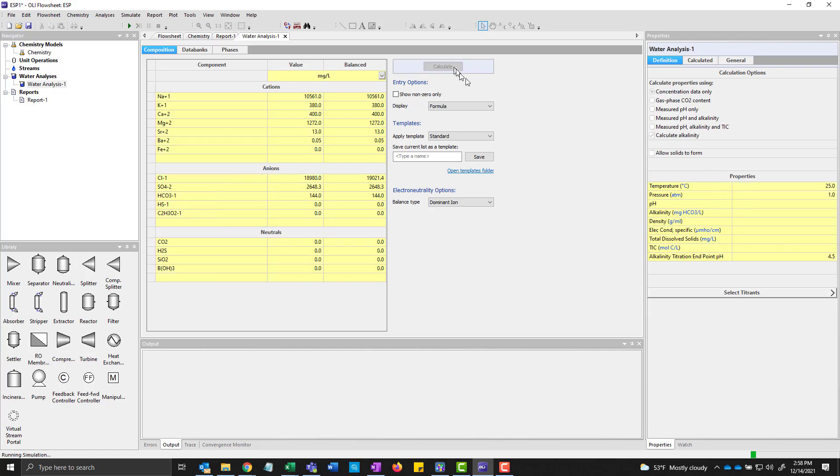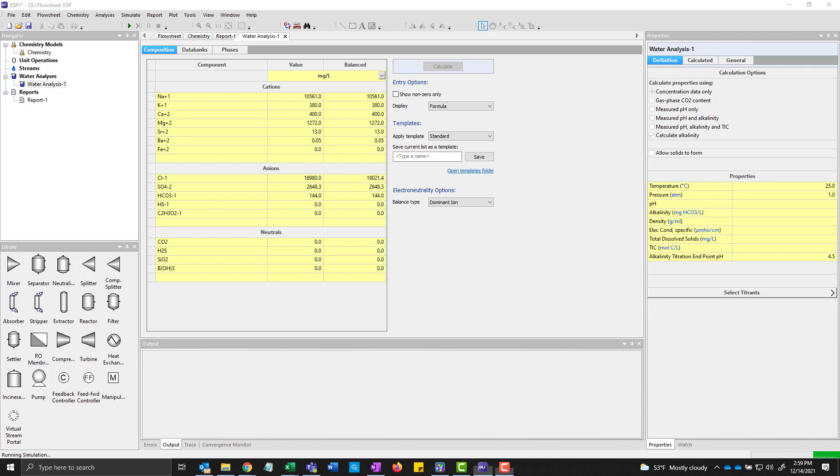We'll go ahead and calculate it. And it'll take a moment or two to actually calculate. And it's done.